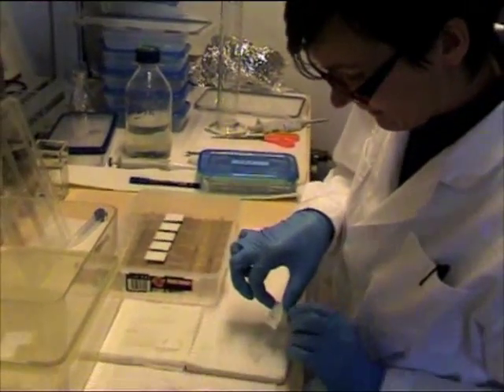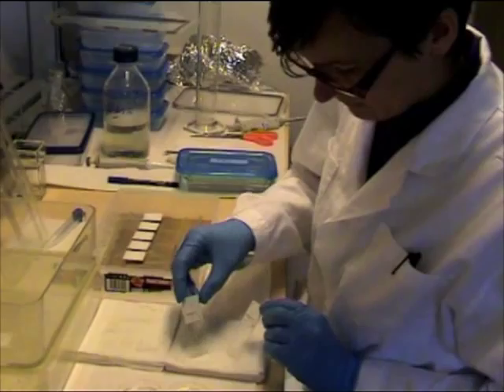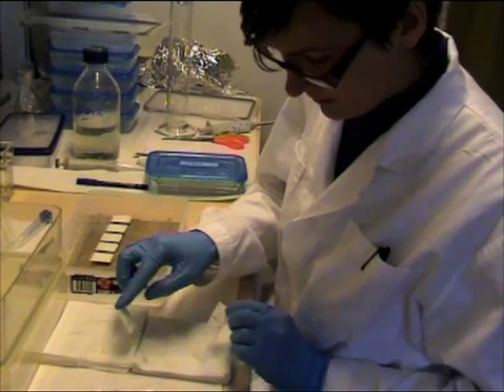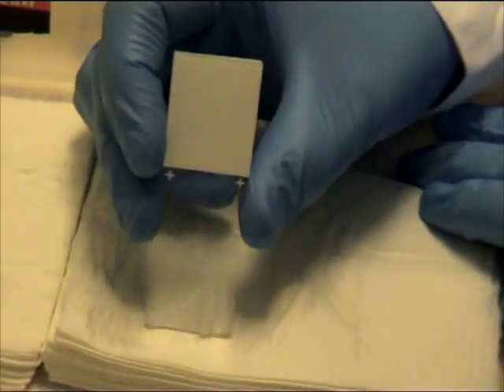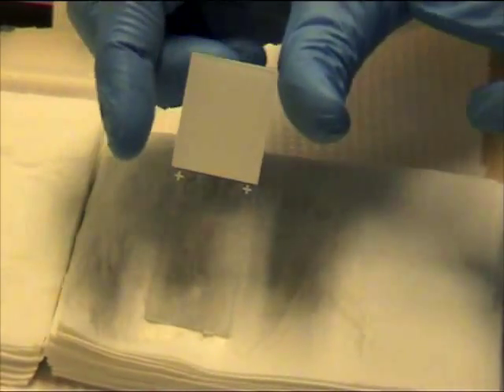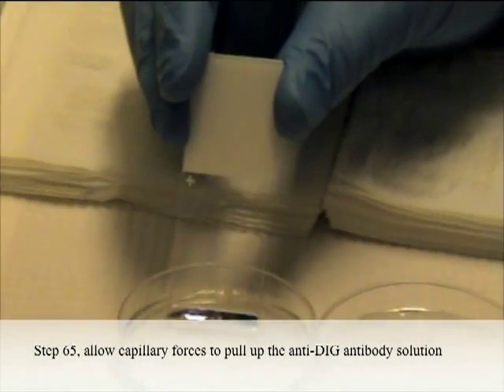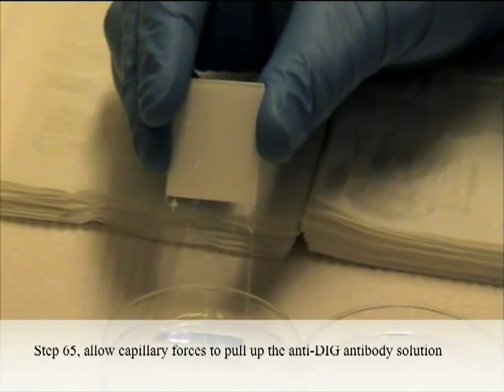The antibodies are added to the slides using Samogin. Samogin only works with ProBond plus slides or slides of a similar design. Step 65: Allow capillary forces to pull up the anti-dig antibody solution. This step is repeated.